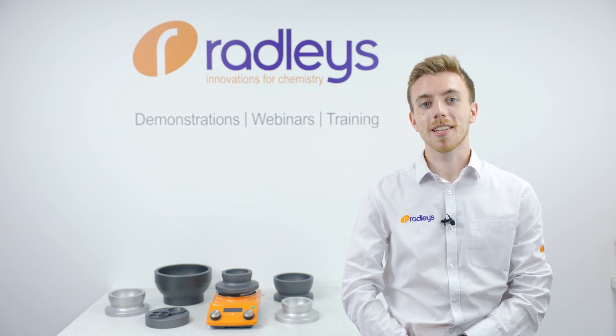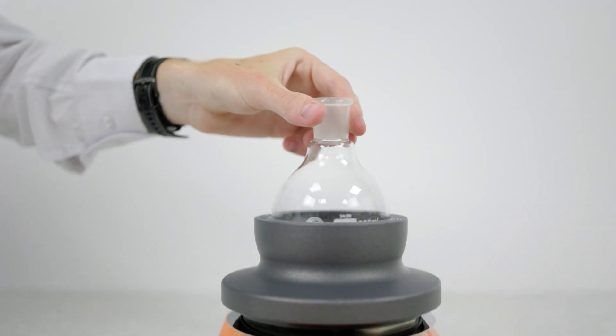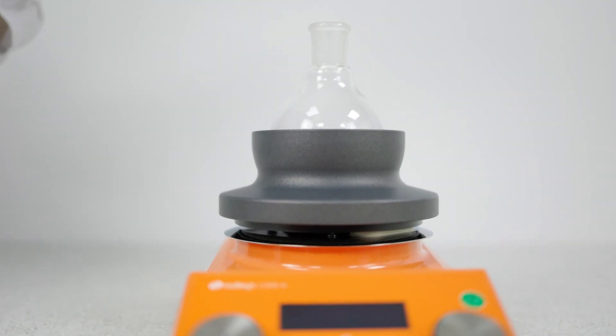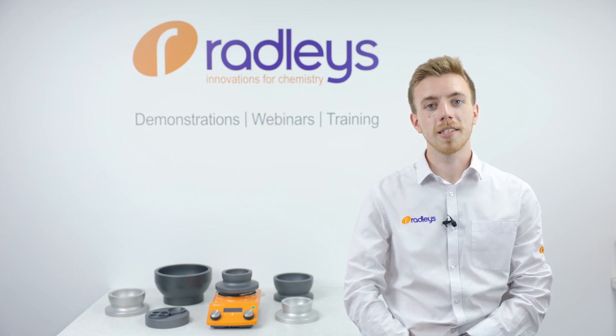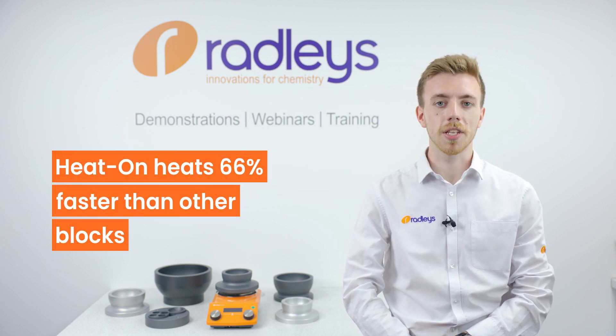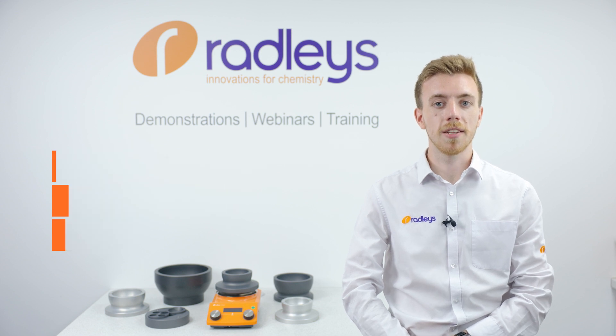Heaton blocks are designed slightly differently to other blocks. You can see the flask fits a long way down into the block, so they're very deep, which means excellent heat transfer. The blocks are also as lightweight as they can be — there's no unnecessary material or inserts to slow down the heat transfer. They heat more quickly than a lot of other designs.